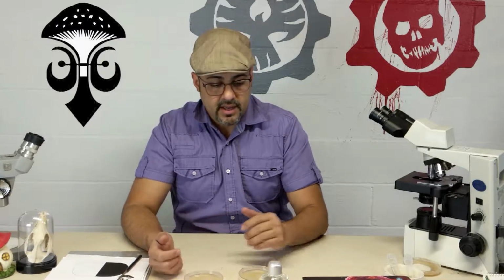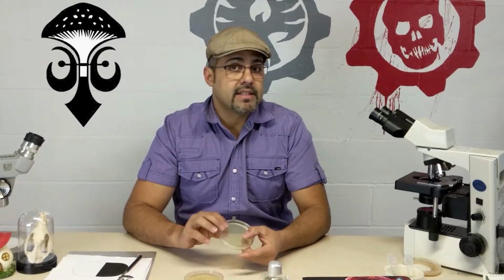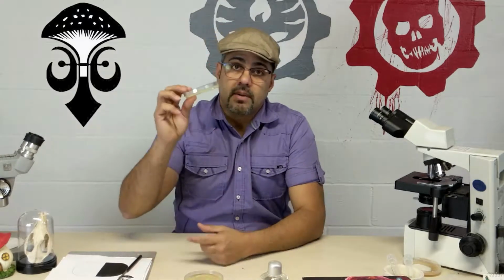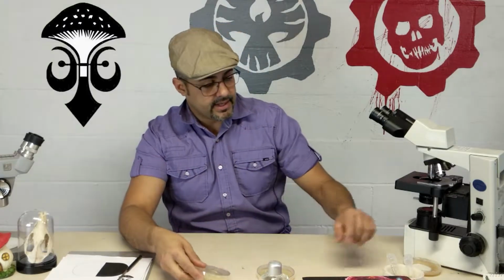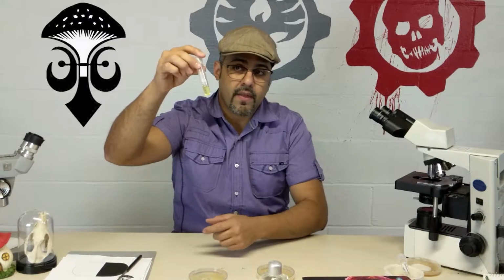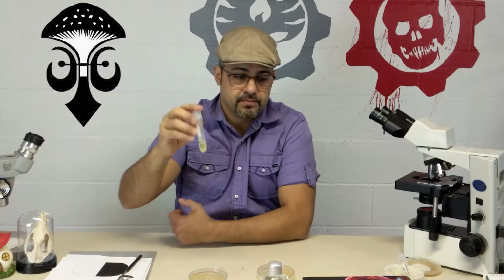The following video is meant for those that are taking microbiology class, especially general microbiology. One of the first labs and techniques that we need to learn and understand is how to transfer bacteria, yeast, or any microorganisms, could be mold, from plates to different other media. It could be another plate, it could be tubes, broth, or tubes that have agar and are slanted.